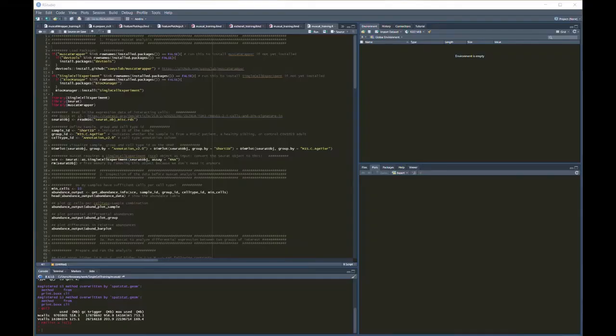In the second part of this movie, we will go over the script that shows you how to perform such a Muscat differential expression analysis. While Muscat itself provides tutorials about how to run such an analysis, it might be quite difficult to adapt their pipeline and visualizations to your own data if you don't have much programming experience or experience with statistics and bulk RNA-seq differential expression analysis in R.